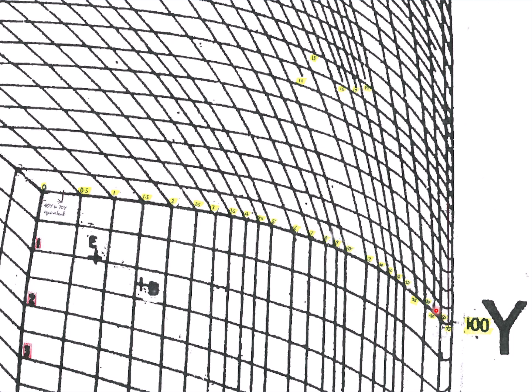So if two operators, one gets a value of 3 and the other gets a value of 5, numerically it may look like a very low difference, just 2 units. But actually, because of the logarithmic nature of the scale, the color difference is huge. However, if two operators on the Model F get a 30 Lovibond yellow unit and a 40 Lovibond yellow unit, it may look like a numerical difference of 10, but the color difference is very, very small and hardly noticeable.